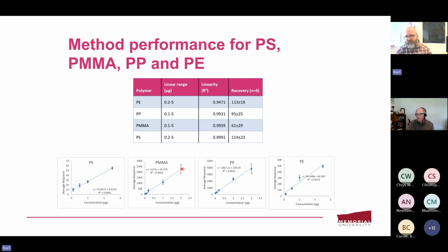And I can tell you something that I think most people won't tell you in their papers. It's quite difficult to generate good quality calibration curves with polymers, or maybe this is obvious to the folks in the polymer group. It was quite a surprise initially. We found that in the paper, dissolving the polymers in heated toluene was effective. But more recently, we found that suspensions of particles in a methanol DCM mixture proved to be easier to work with. So just as a practical piece of advice.